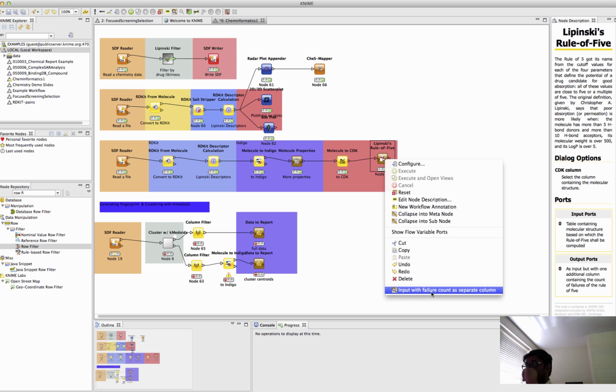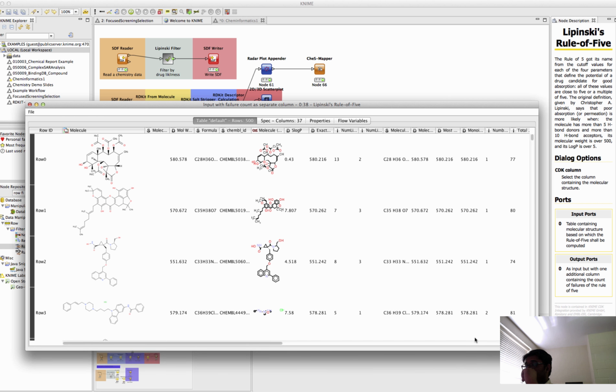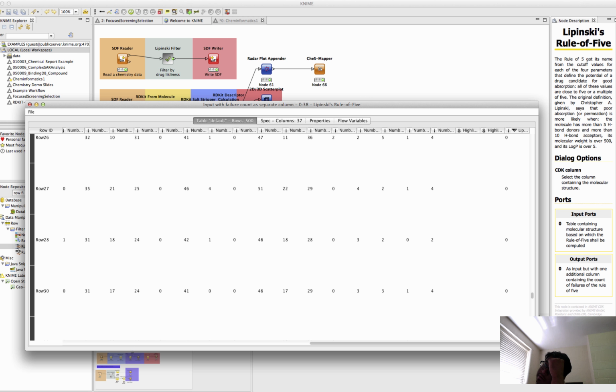And then you can also just see the failures. So these are the Lipinski. There are like three things which didn't match. There are many compounds. You can do a row filter using the upper bound, which has minimum zero and upper bound of zero. So all the compounds which have a count of zero will get filtered out, like one or more features are not included.